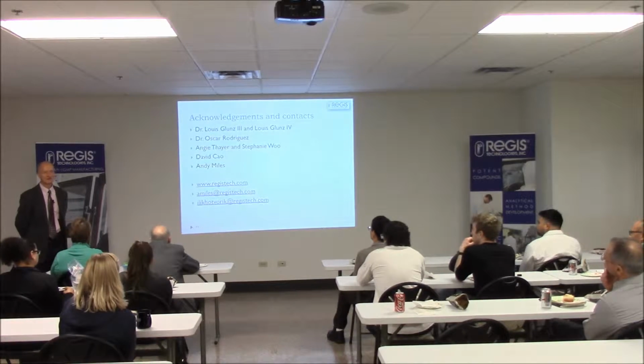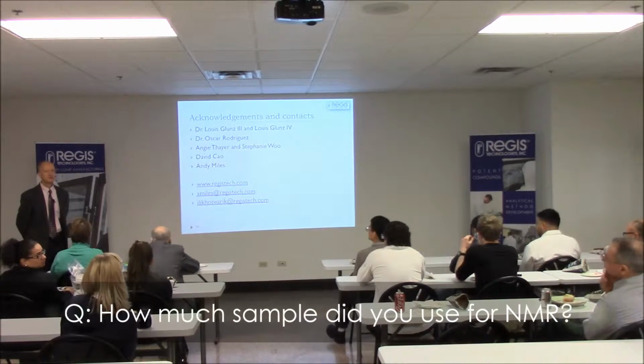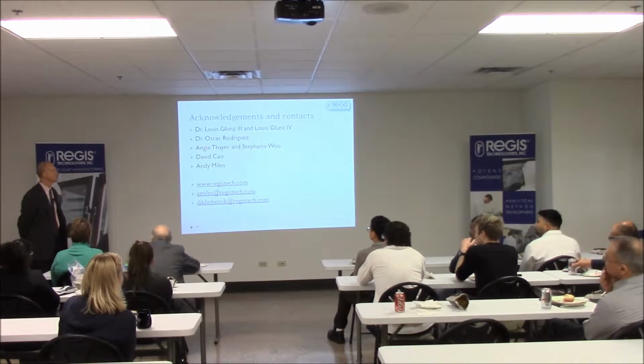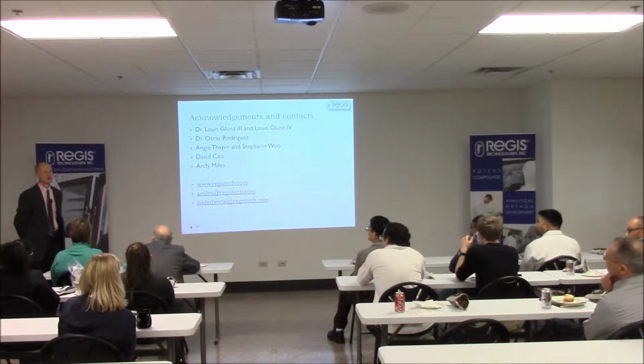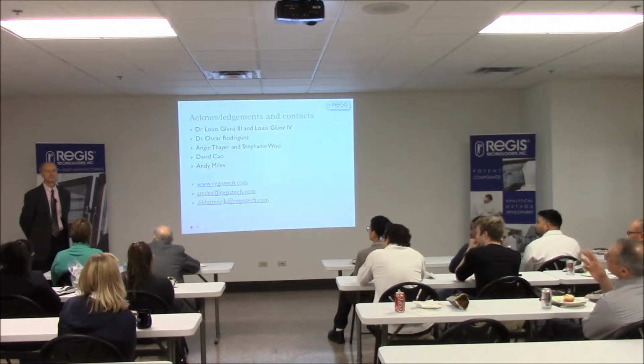Any other questions? So how much sample do you typically use? In order to save time, it's good to use like 100 milligram samples. So for these particular case studies, it was around 90 to 100 milligram, because typically chemists have it. But I would say anything from 10 to 30 milligram would be sufficient, but it would take much more time.